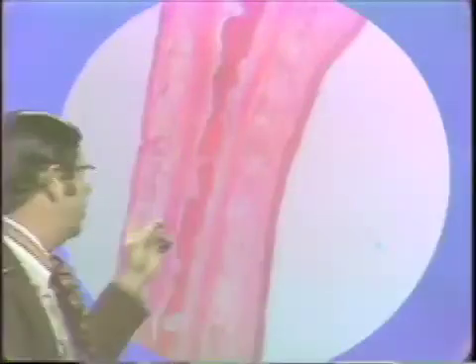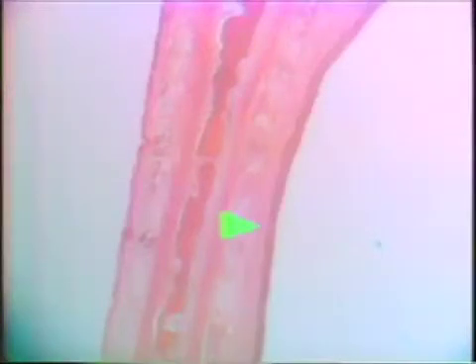I want to show you the epithelium as it lines the oral side of the hard palate. We've got the oral surface to the right and the nasal surface to the left, with bone in the middle. This happens to be a term fetus, and the epithelium isn't as keratinized as it would be with function. In the anterior part of the hard palate, we have ridges of tissue called rugae. Going posteriorly, we start to get some glands — these are going to be pure mucous glands.